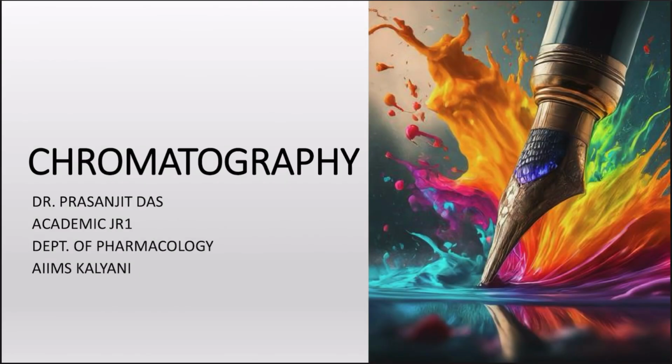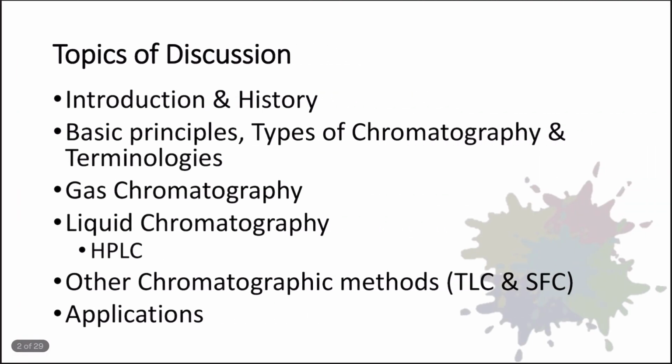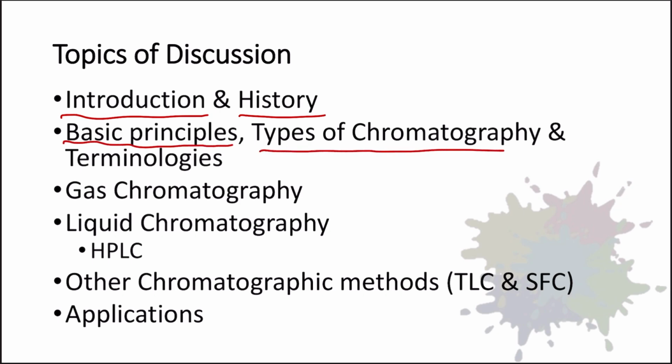So guys, today I am going to present the topic that is chromatography, which is one of the separation techniques, that is analytical techniques, which is commonly used in laboratories for analyzing different samples. So in this presentation, we are going to discuss this topic under the following headings: the introduction to chromatography and the history of development of chromatography, basic principles involved in chromatography, types of chromatography, and several terminologies which are related to chromatography.